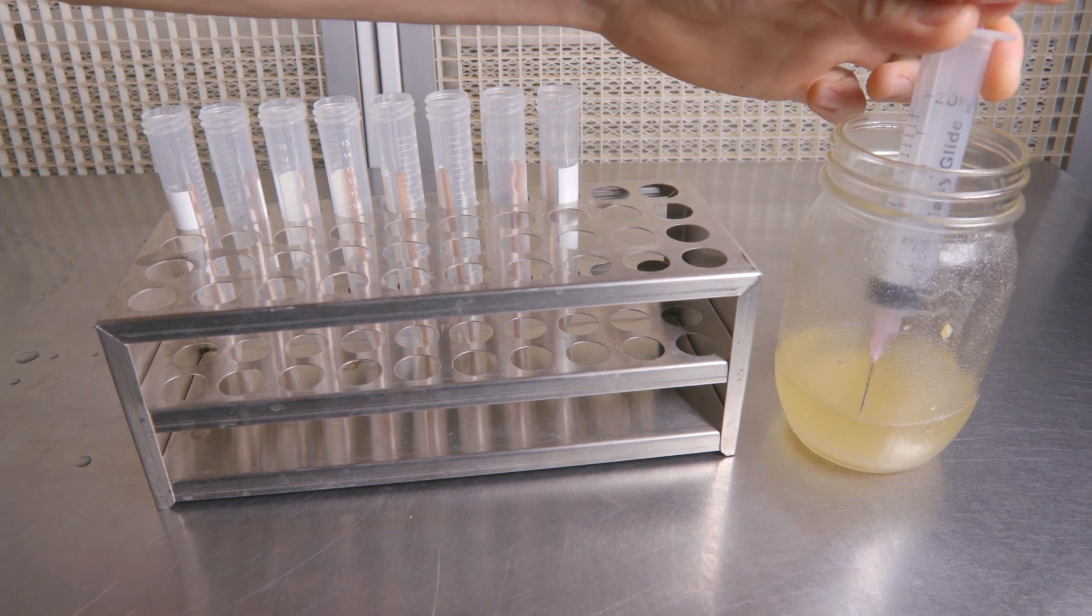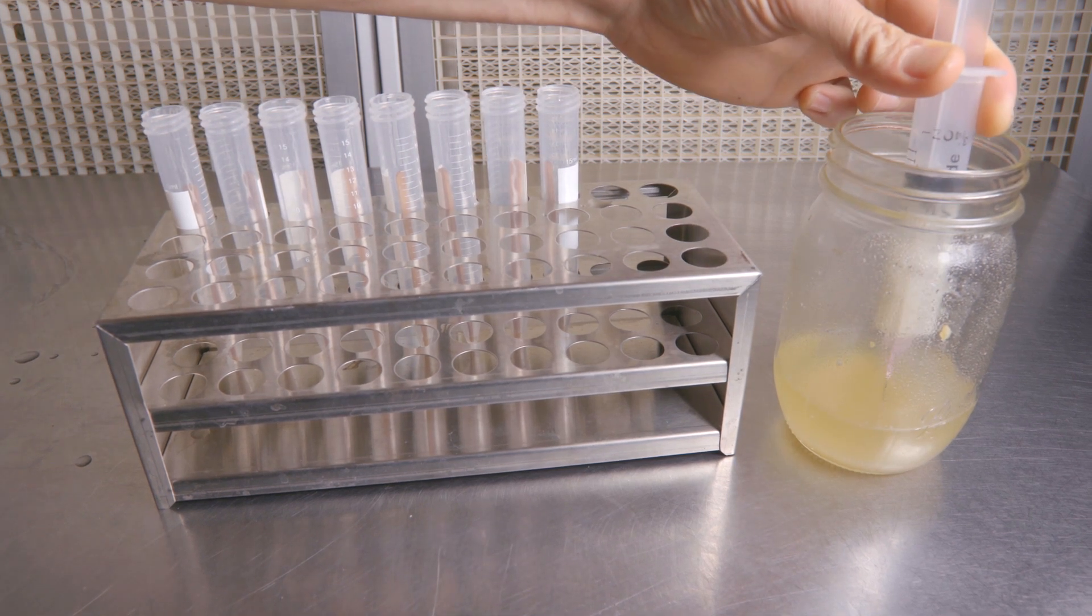Now cap off your slants and agar and place everything in your autoclave or pressure cooker for sterilization. Now it's time to measure out our media.